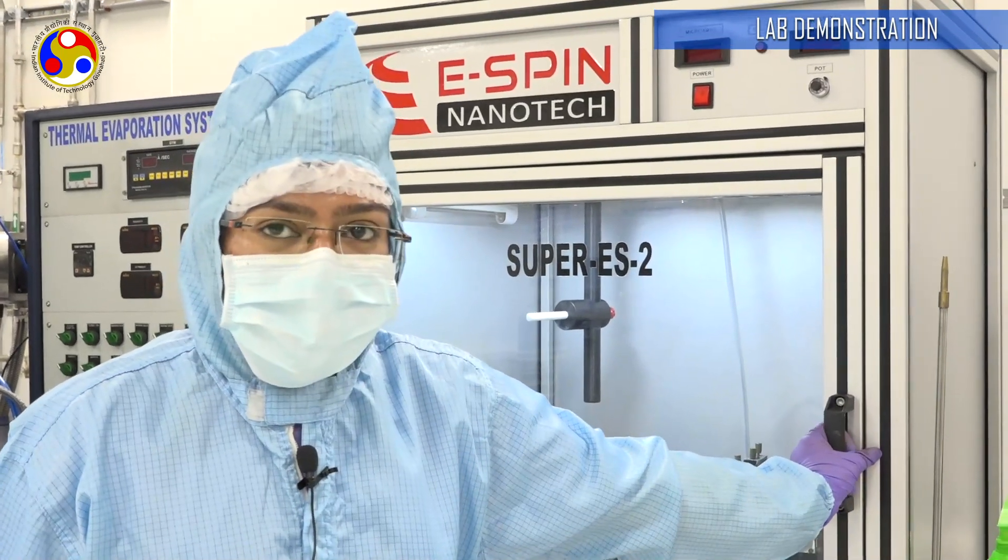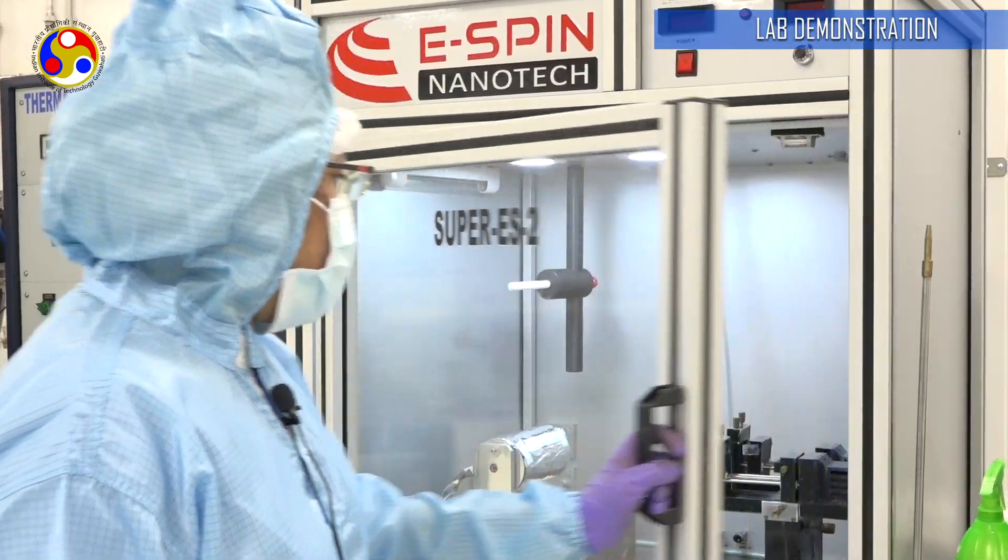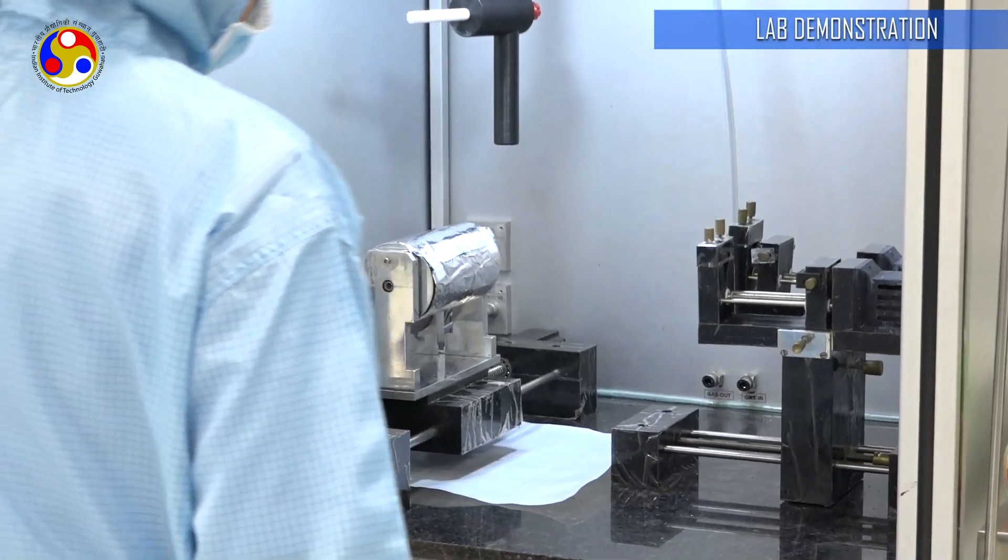This is the device and it's been acquired from eSpin Nanotech, a startup based out of IIT Kanpur. Let me show you the various internal components of the device.